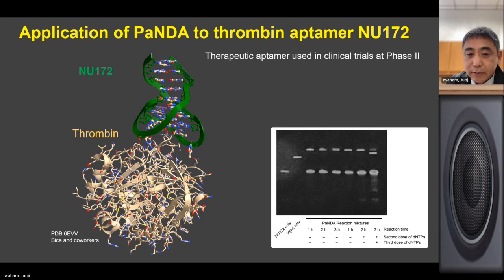Another question then, if that's all right. I used to use T7 RNA polymerase to make RNA, and we would often optimize the ribo NTP concentrations based on the composition of the RNA being produced. Have you tried that, or are you recommending the same concentration of each of the four?